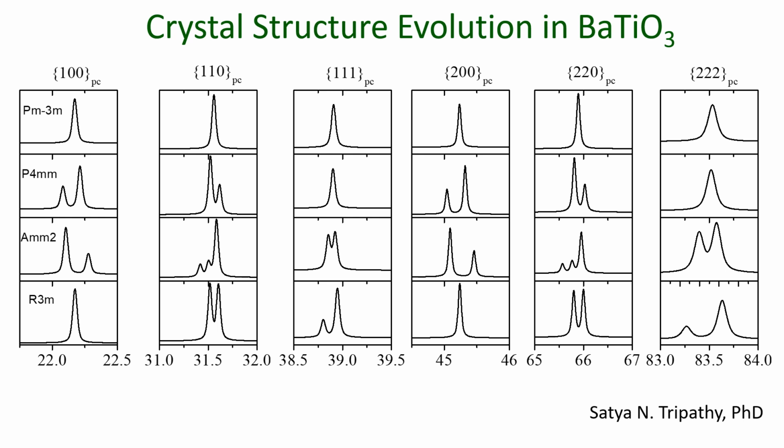In this video, I am going to demonstrate how the crystal structure of barium titanate varies as a function of temperature, and what the most important features are that you should notice while you report different pseudocubic reflections in a journal.